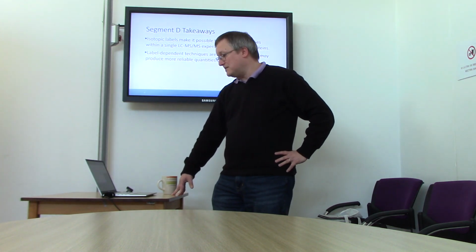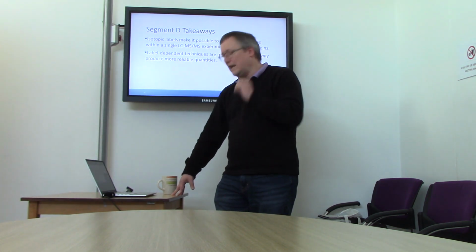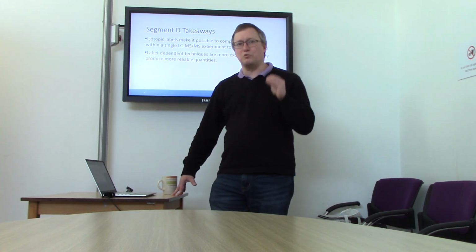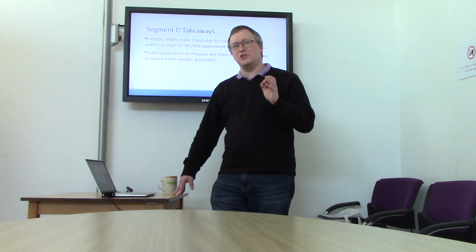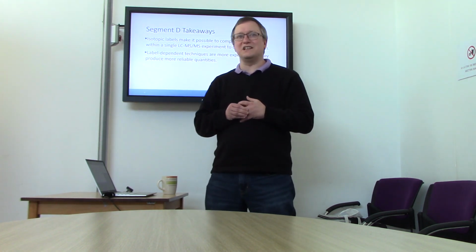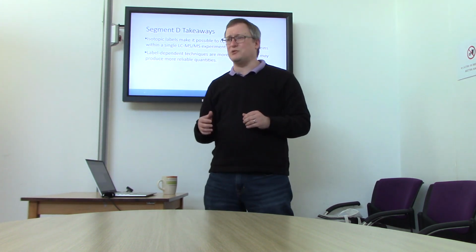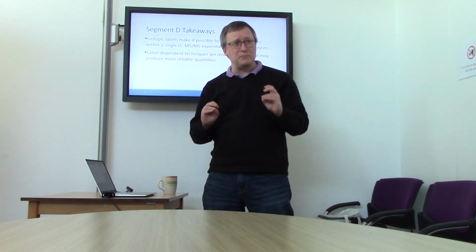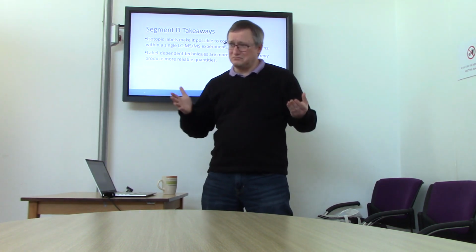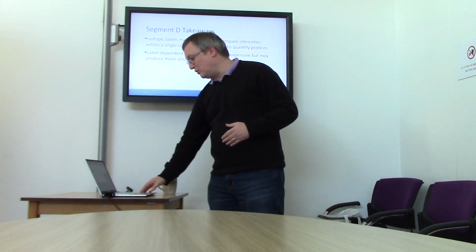Label-dependent techniques are more expensive, and there's also a widespread perception that label-dependent methods, these strategies using iTRAQ or SILAC or whatever, also produce more reliable quantitation. I'm not sure that really holds water. Having performed differential proteomes in data sets that involve the same samples, but some were done by label-free techniques and some were done by iTRAQ, it's not entirely clear to me that the perception that label-based methods produce more accurate quantitation is actually true. So I would consider that one as an as-yet unproven assertion by the folks who rely on label-based quantitation.